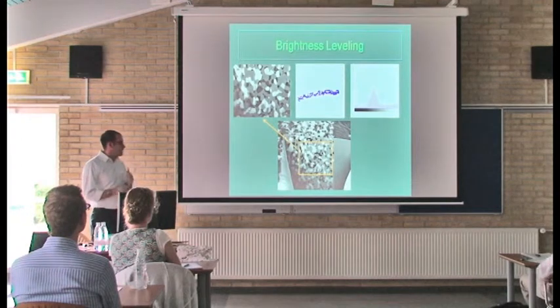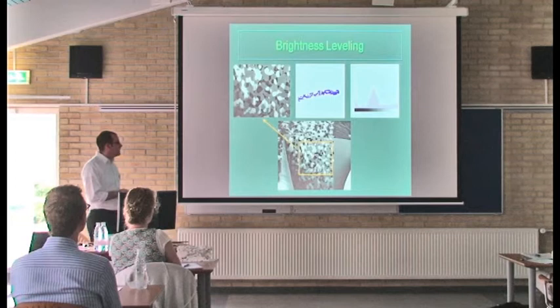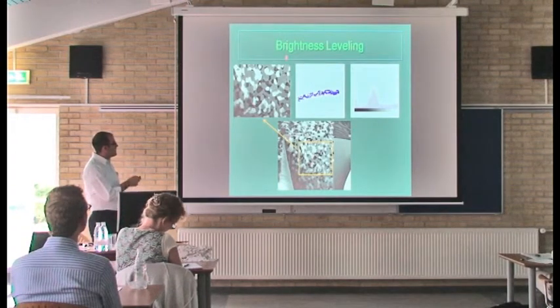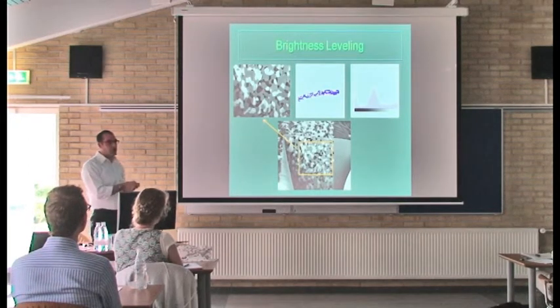And this is actually a lot of work from the past year or two that Scott Cronin's been working on in MATLAB. This is very similar to what Peter showed with the illumination across the image. You can see it's much darker here than it is here. We go about it a little differently. So we basically look at the histogram for each row, where you can do each column and plot that, and then fit a curve to it.